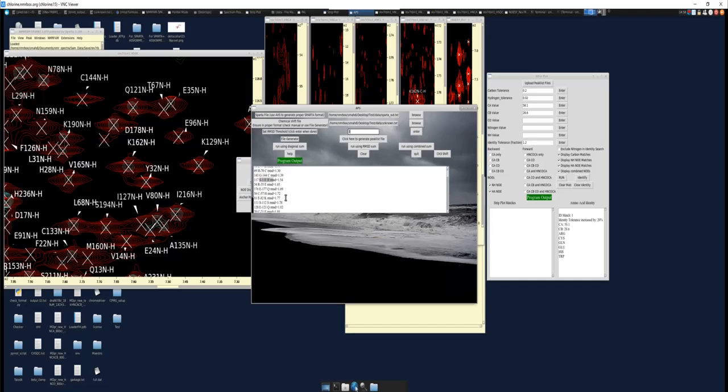And again, this is also why I would highly recommend against just using Sparta Plus for your assignments, or only using 2 amino acid chemical shifts for your assignments. Because as you can see, this is actually 162. And if you look here, we don't even really have lysine 162 here, right? So this sort of shows why you need more than just the 2 that you have.